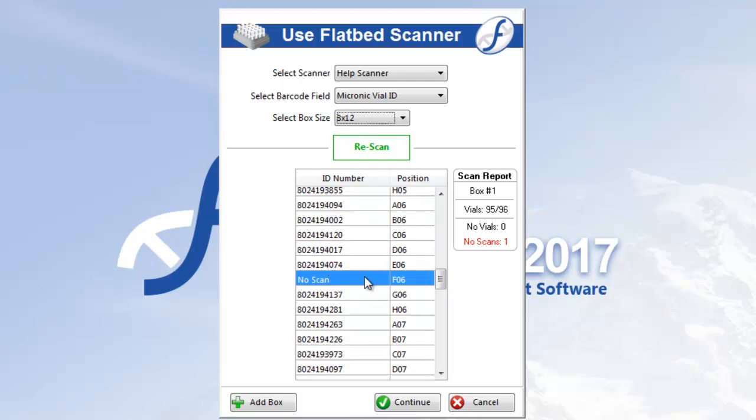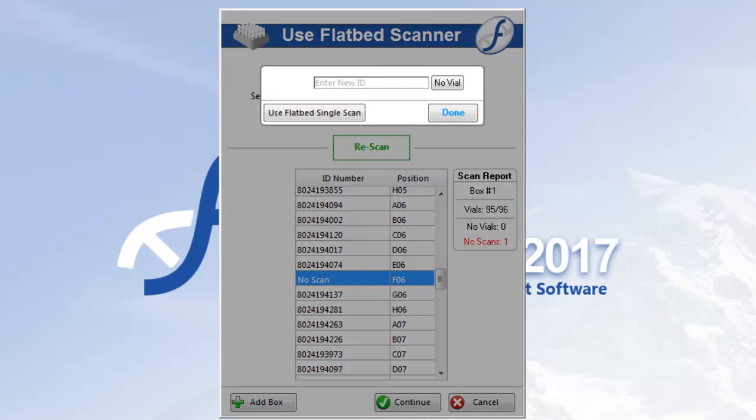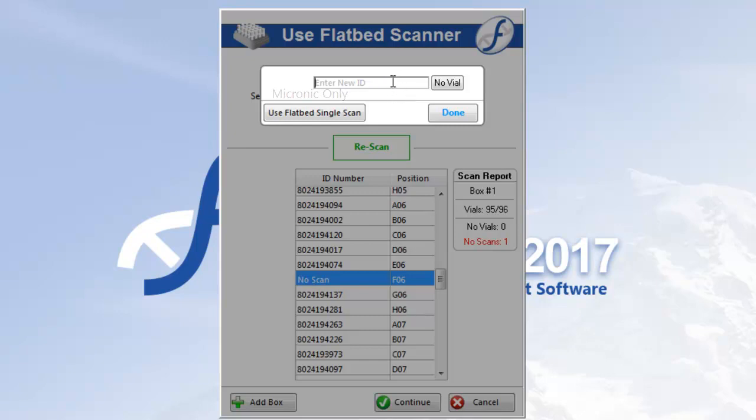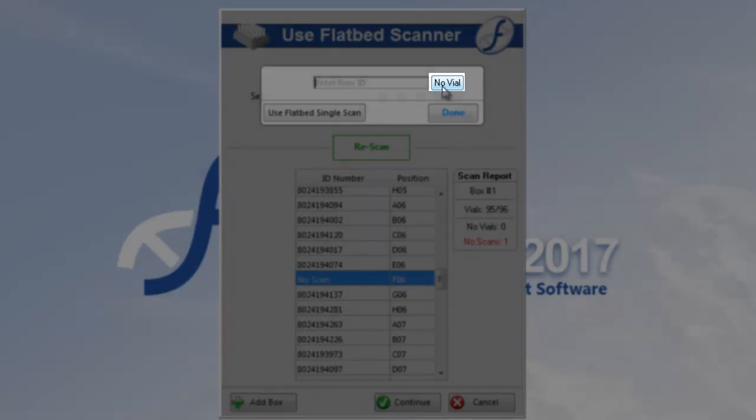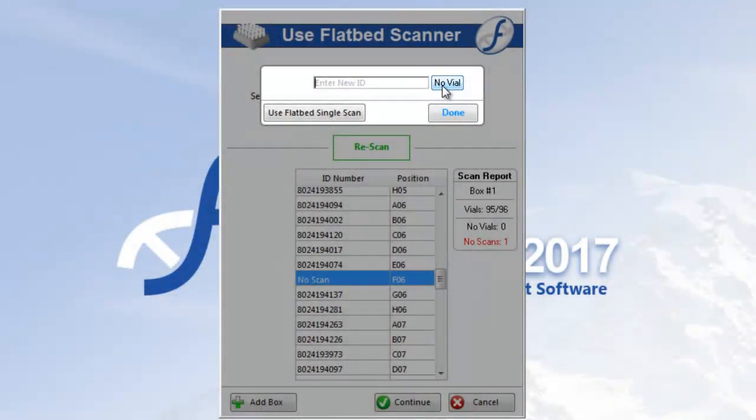You double-click the no scan line and the edit overlay will appear. From here you have three options. Either manually enter the vial's data using a handheld scanner or your keyboard, you can also use your flatbed scanner single scan reader, or you can simply click no vial to change the line accordingly. Empty positions being treated as no scans can be a common problem, so the no vial button provides a quick and easy fix.